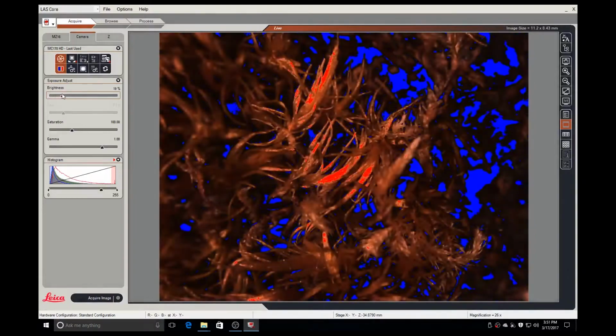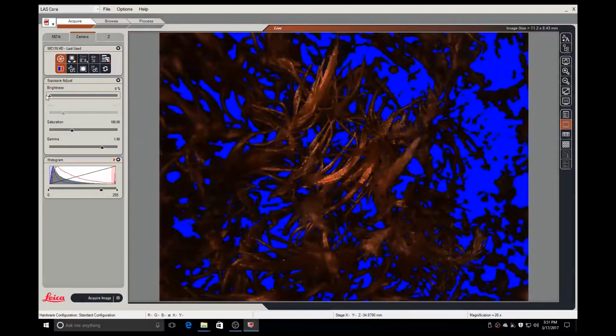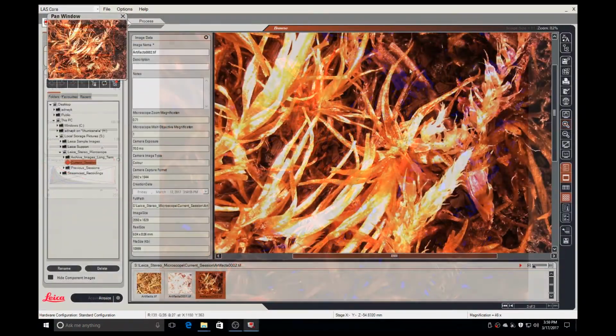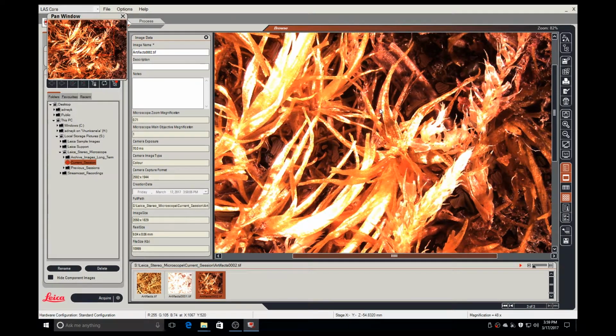or overexposed areas, and increase and decrease the prevalence of blue or underexposed areas. Points of over and underexposure will appear as artifacts in your final image, so you should reduce them before image capture.